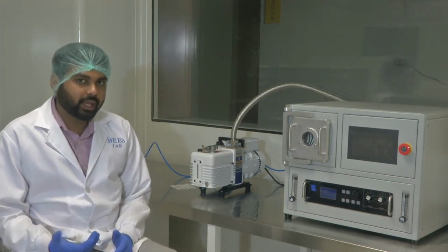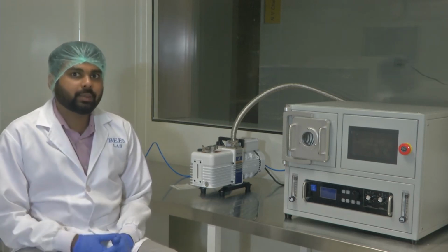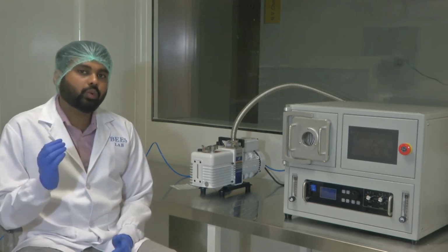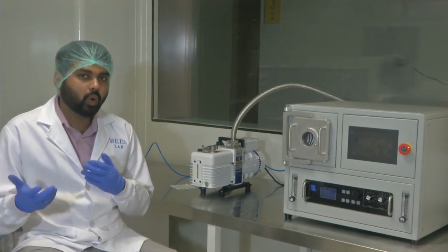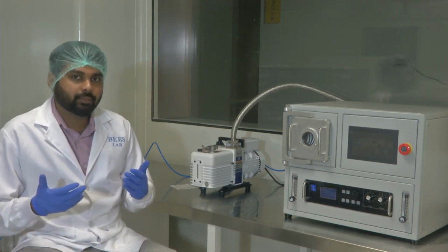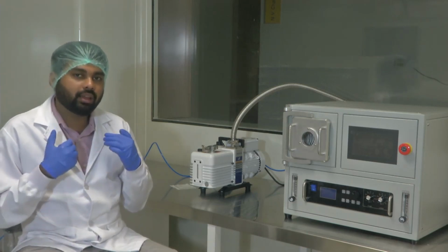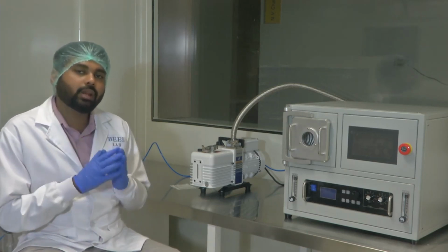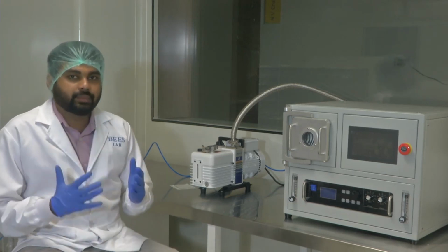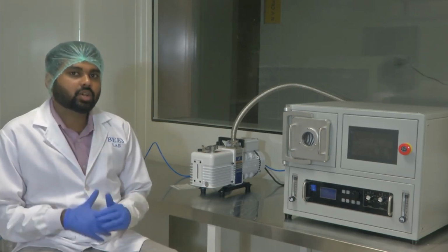There are a lot of things that happen in a plasma. The electrons will be there, charged ions will be there, molecular ions will be there, atomic ions will be there. When I say atomic ions, it is the O2 which with energy becomes O atoms, and those atoms also get ionized. So the atomic ions will be there, molecular ions will be there, moving electrons will be there, normal oxygen molecules will be there. It's a mixture of a lot of entities. Such a mixture is called plasma.